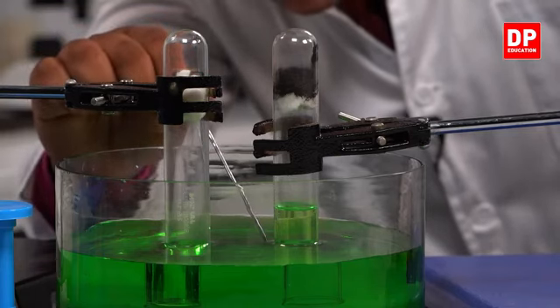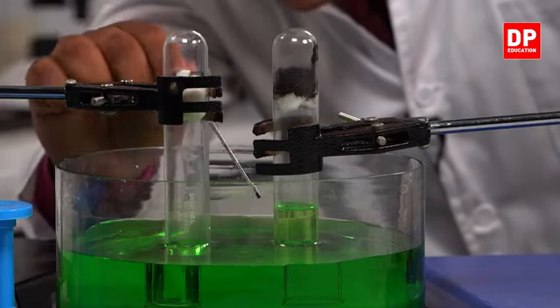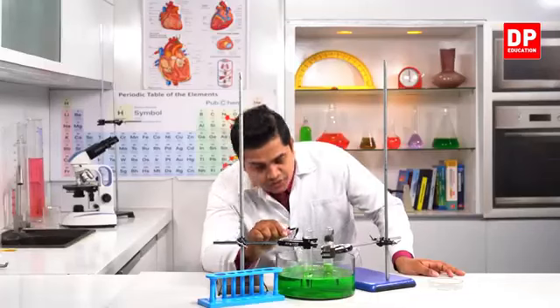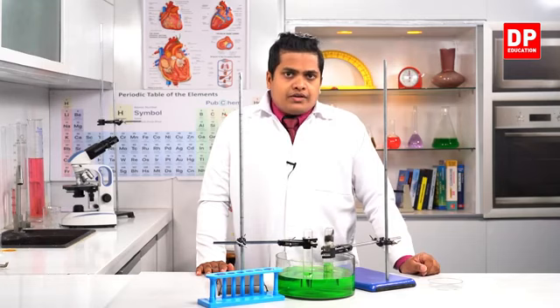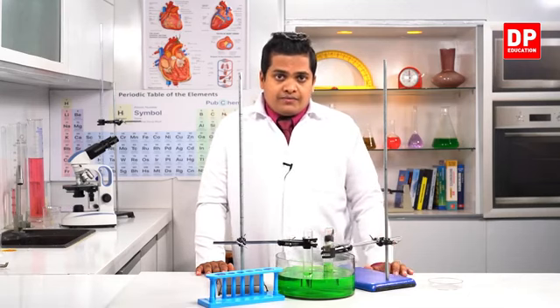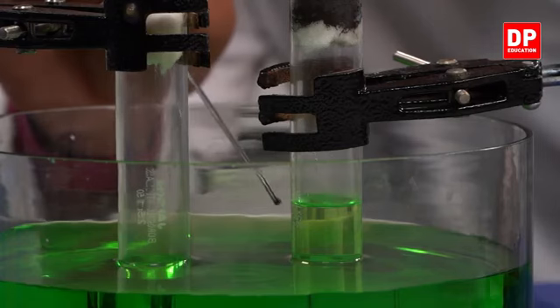So from here to here, let's compare by using this boiling tube. We'll compare how much water has risen up in this boiling tube. You don't need to get a more accurate answer in this, just a rough value. This is to get some idea. So we'll compare how many times the water has risen up.